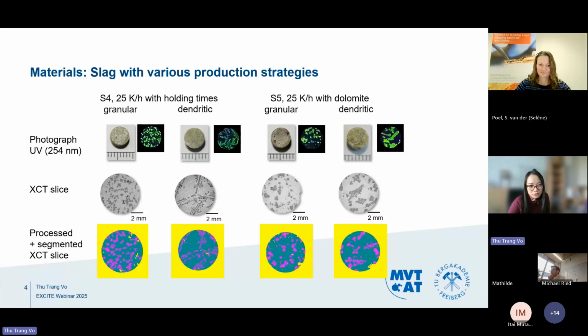And for me, it was cylindrical formed, so that I, in the end, know what kind of fractures or fragments I can get, because at least I know how the outer form of my initial particle looks like. And I also wanted to reassemble them. So imagine I have a lot of fragments, and these fragments need to be puzzled back again, because I also wanted to know where my fracture surfaces lay within the initial particle. So there will also be some virtual reassembling ongoing, and that's why I needed to know the initial borders.